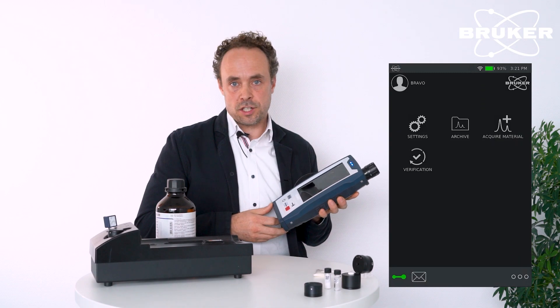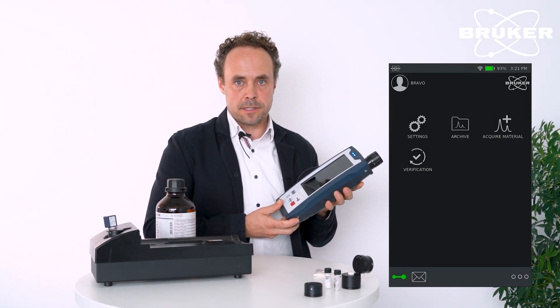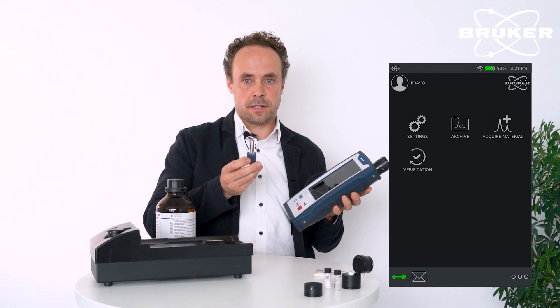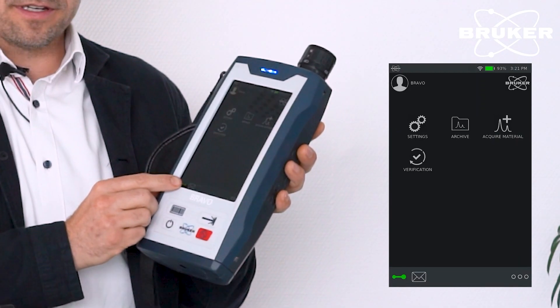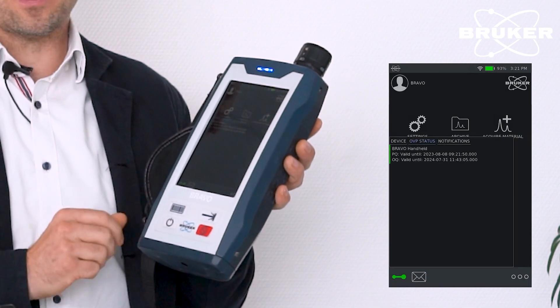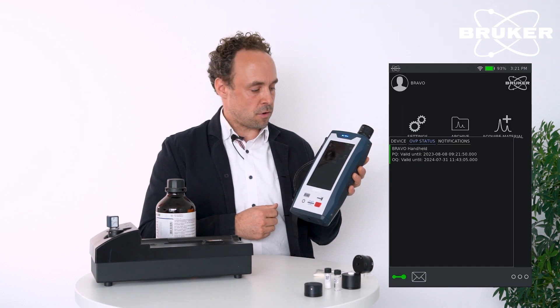In validation mode, the instrument always ensures valid system tests, which can be performed utilizing certified and traceable reference materials. Here in the lower bottom of the screen, you see the status indicator showing that the instrument is ready for a measurement.